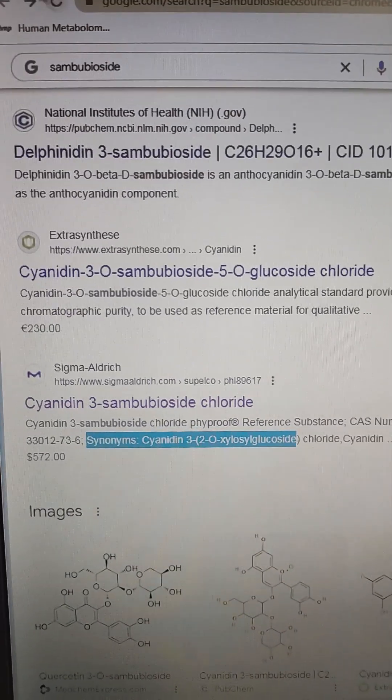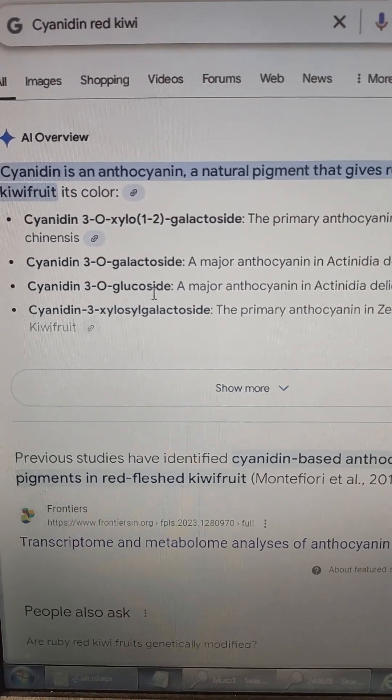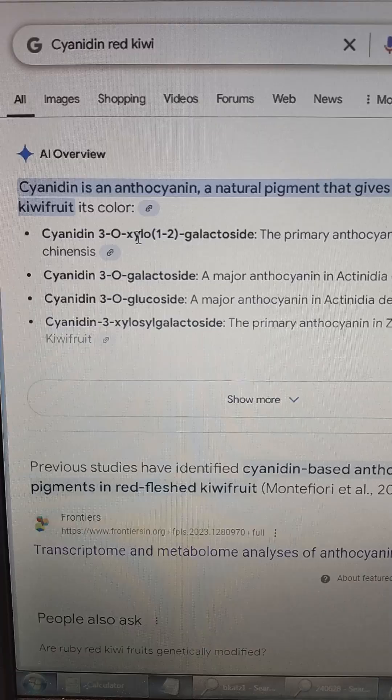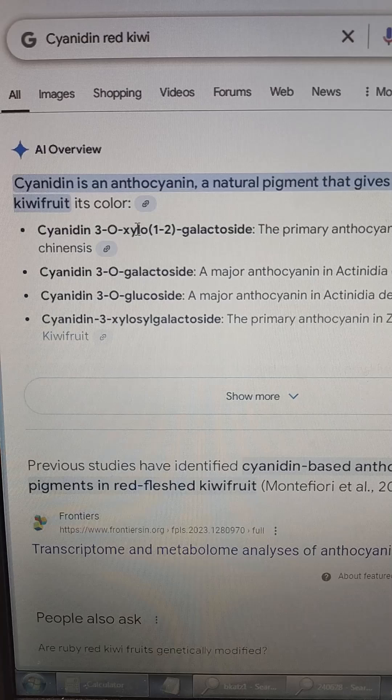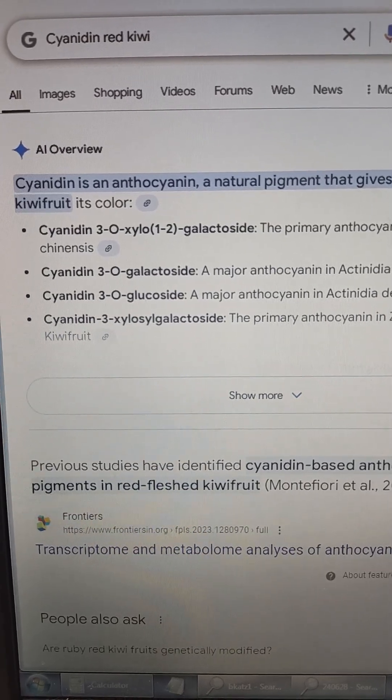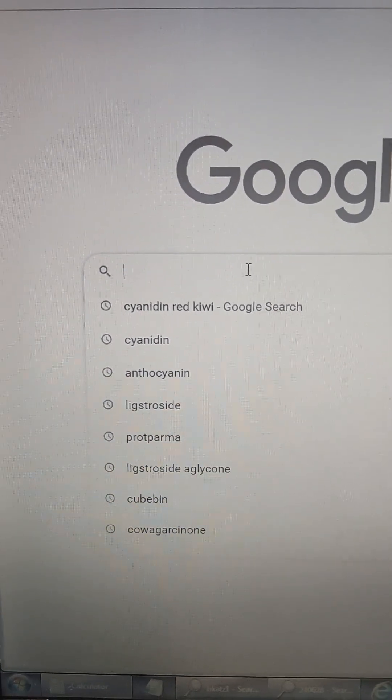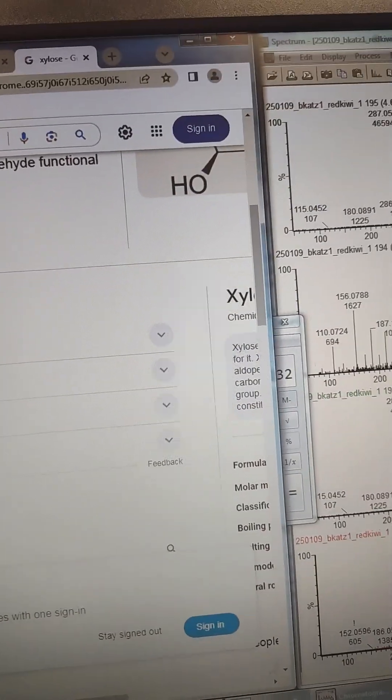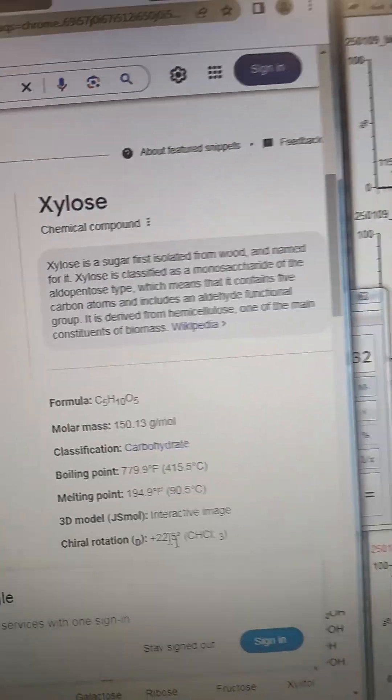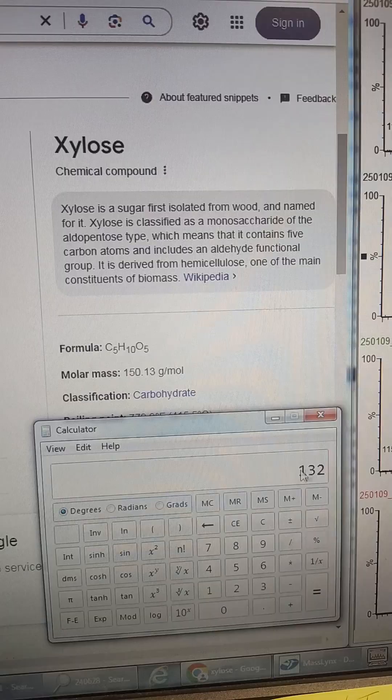So you search cyanidin, anthocyanin, natural pigments in red flesh, red kiwi fruit. It looks like it could be a galactoside, a xylo galactoside. And so if we look up xylose, we know galactoside and glucoside are both 162 conjugates because they're 180 minus the water of conjugation. If we look up xylose, it's kind of an unusual fruit sugar, wood sugar actually. And that's 150. And so 150 minus 18 for the conjugation is 132.